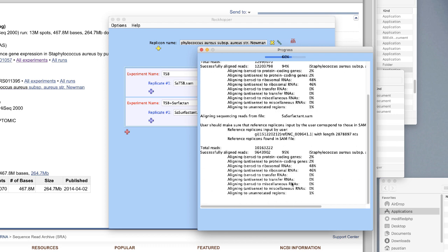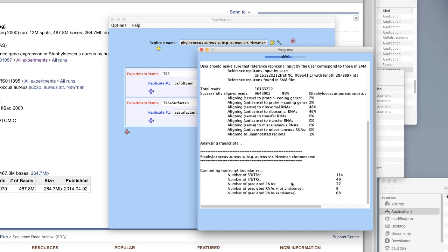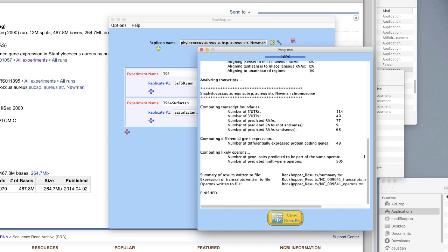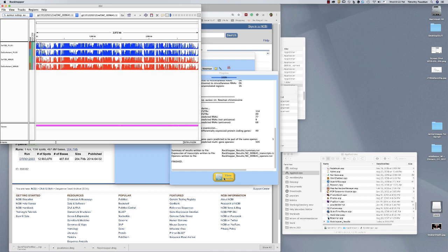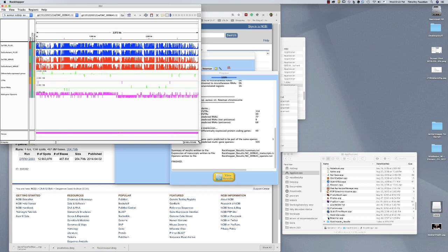It's all done. Now it is going to start comparing and analyzing them. If you want, just for fun, you can view the results by clicking the Integrated Genome Viewer. You click on this and it launches the Integrated Genome Viewer, which will actually map this all to your genome and show you where the expression is, which is kind of cool.